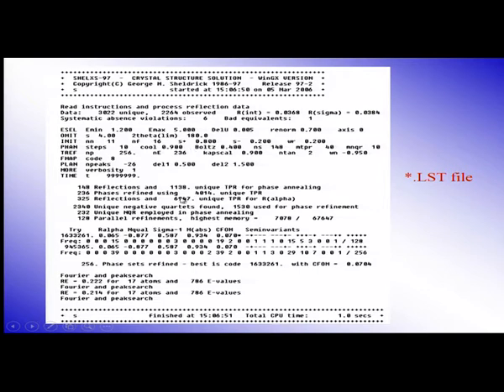Now, if you look at this end, it is telling the map name is E values. So, what you have done is not a Fourier map but an E map, because direct methods assume point atoms, you have converted mod F into mod E, and only that you use. We use only strong E values, 786 values have been used, and here they are given the cutoff. Minimum E value selected for generating the triplet is 1.2, maximum is 5.0. So, that is all. Based on these direct methods, it has given positions of 17 atoms.